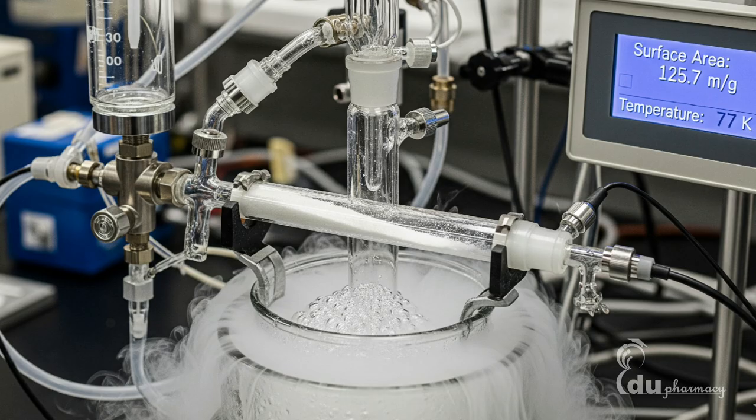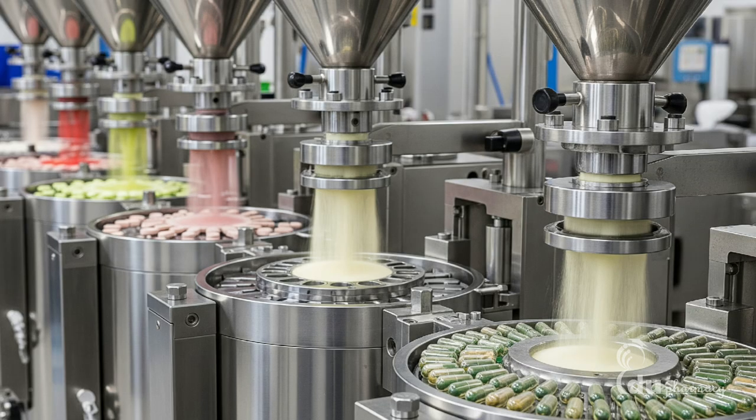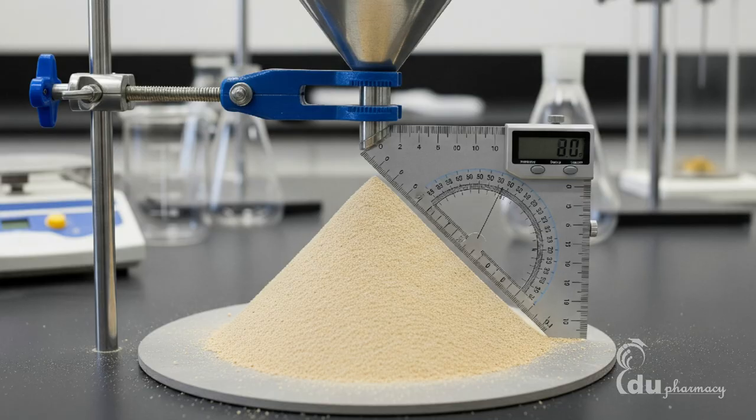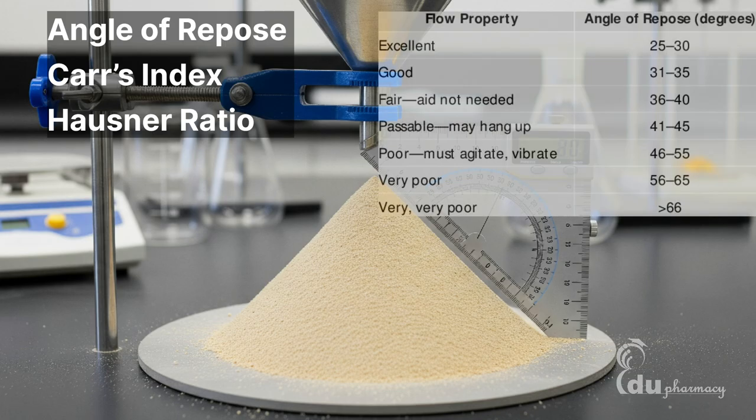Another key property is flow. In large-scale manufacturing, powders need to flow smoothly into tablet presses and capsule filling machines. Poor flow can cause inconsistent fill weights, which leads to dosage errors. To evaluate flow, we look at parameters like the angle of repose, Carr's index, and Hausner ratio. Each of these provides insights into compressibility, cohesiveness, and flowability. If a powder has poor flow, formulators might use granulation or add flow enhancers such as magnesium stearate.